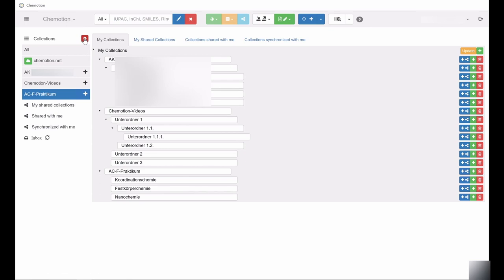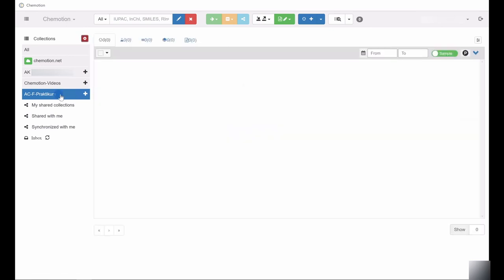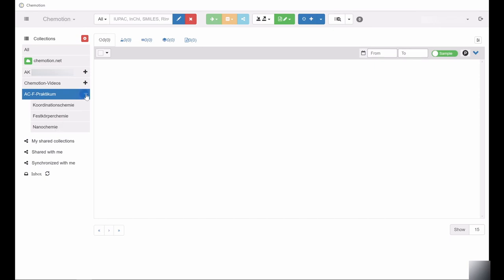To access the newly created collection, select the collection in the column on the left. This column on the left also provides access to shared and synchronized collections.